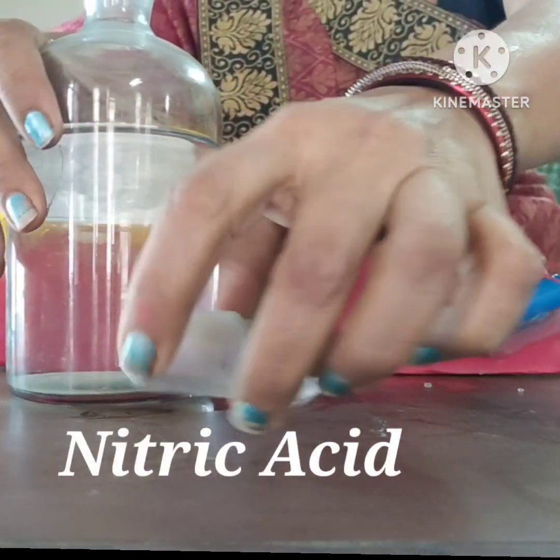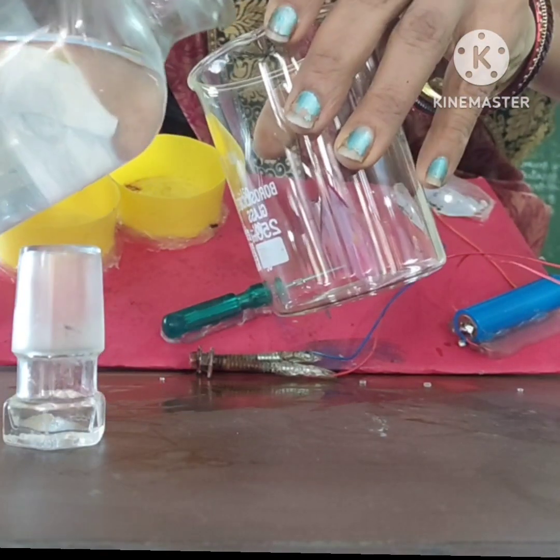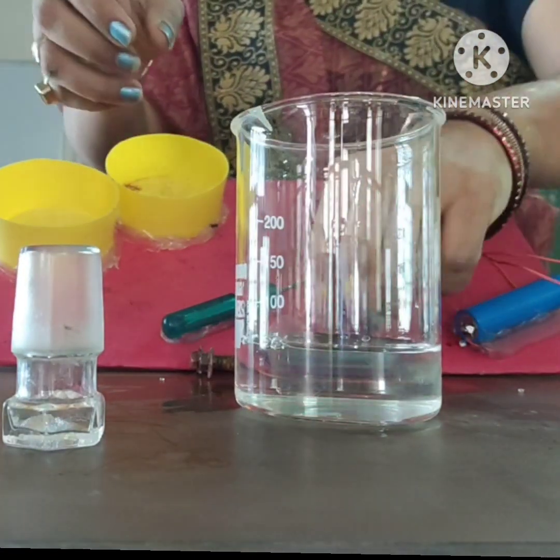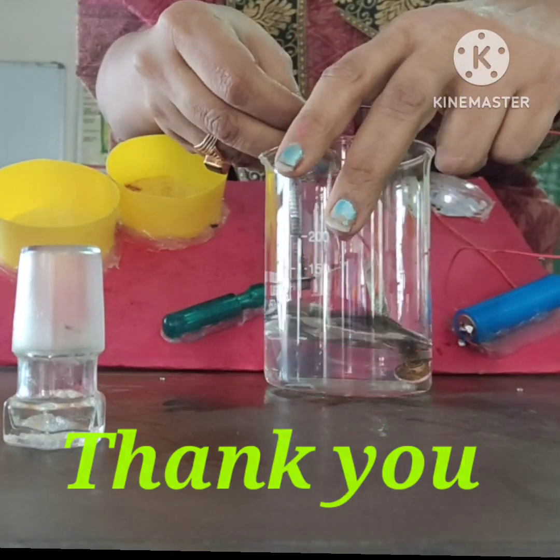This is nitric acid. Let's put both electrodes in the nitric acid and see whether it is an electrolyte or not. Both electrodes are inside the acid and it glows — so it is an electrolyte.